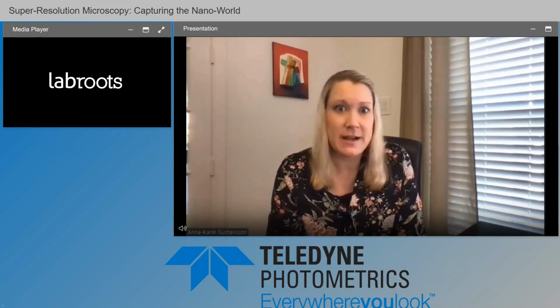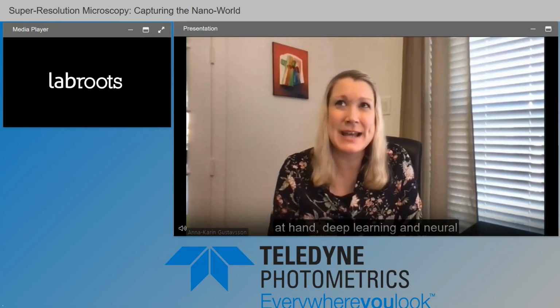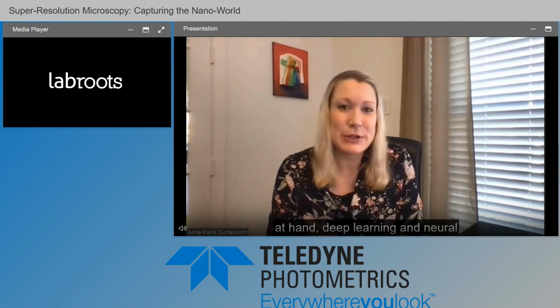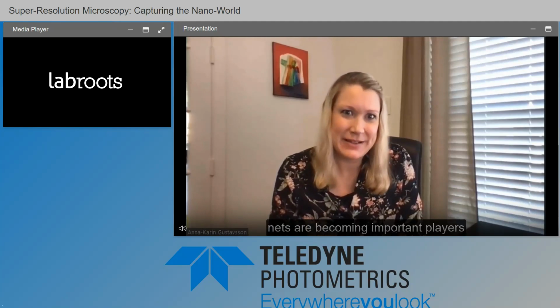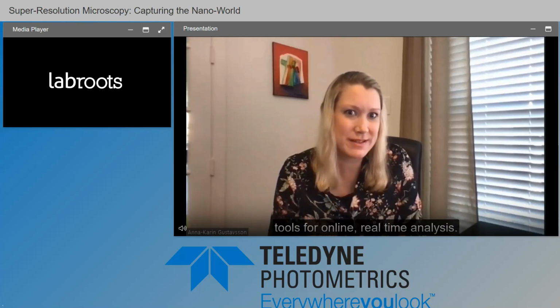And yeah, once again, continuous developments on image analysis algorithms come in handy. Deep learning and neural nets are becoming important players as well, both when it comes to post-processing analysis, but also as fast tools for online, real-time analysis.